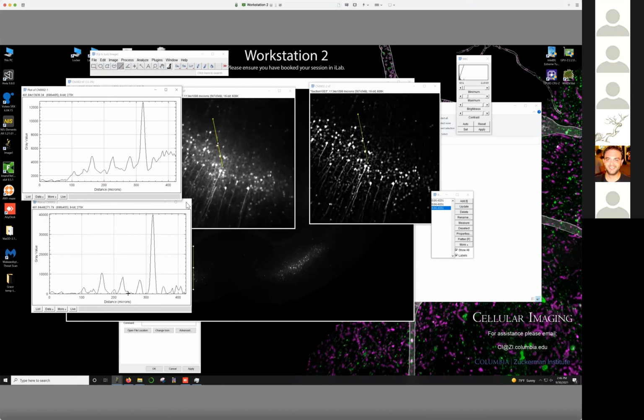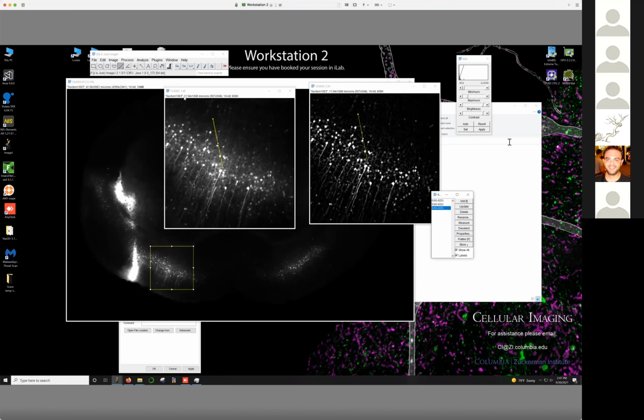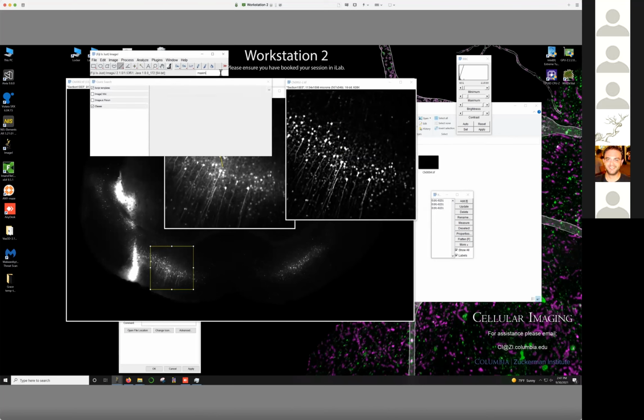One of the most basic ways of then counting these cells, sorry, the mouse has a little bit of lag, so it's sometimes a little funny to use here. If you want to count the cells very quickly, say you have a really easy sample where the cells are really bright and very sparse and you don't want to use Ilastik, then one option is to use a maxima detection. You can see this very easily if I just run the maxima detection from ImageJ here.